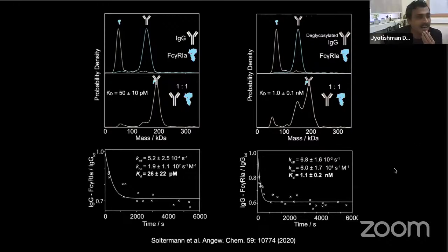Another question. All right, so sorry, Philip. Another question. If you were to think about the denatured state of the protein, you create it in a chemical environment of urea, for example, as in the buffer, or some chaotropic agent. So won't the optical properties and the refractive index now have to be normalized?